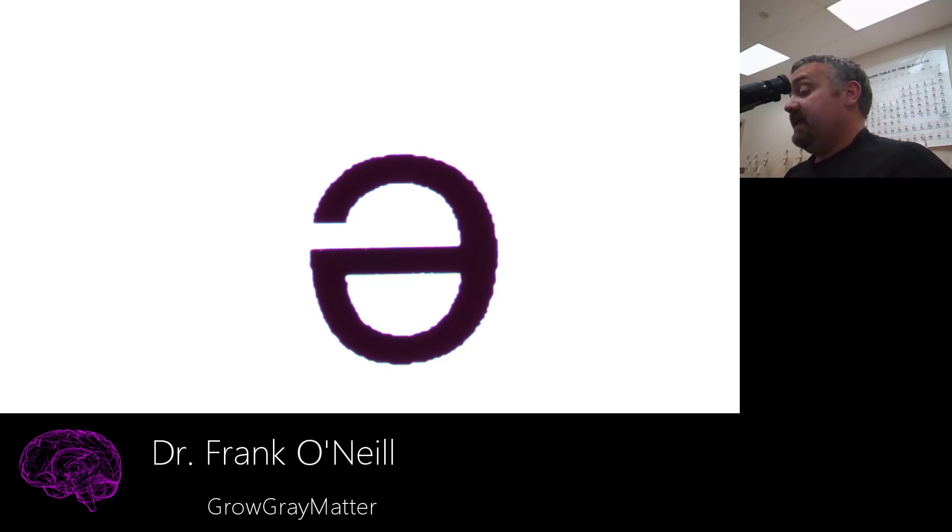But when I put the slide onto the stage, the E was right side up, it was facing the way that it would look if I was reading it. And here you see that it's upside down and backwards. So that's one of the reasons we like to use this letter E, because it shows you that as the light rays are bent or refracted through a microscope, you're actually seeing a mirror image.